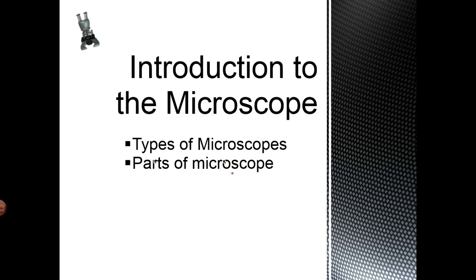This presentation is going to give you a quick introduction to the microscope. Our next unit of study is cells, so it's important to make sure that we understand how we are even able to see cells and understand how we've been able to learn about what makes up a cell, the parts of a cell, and how cells work.